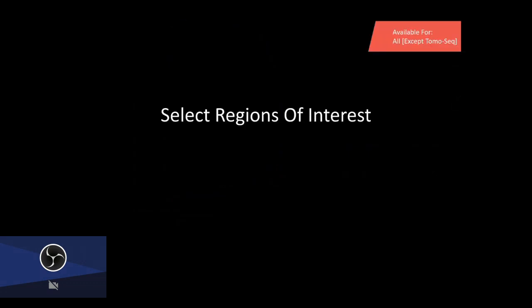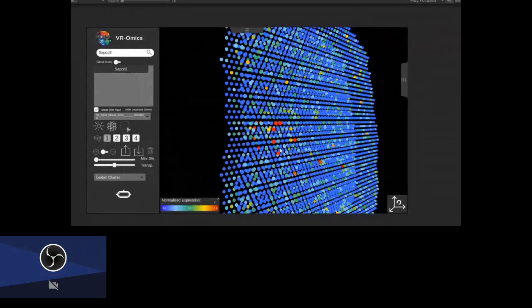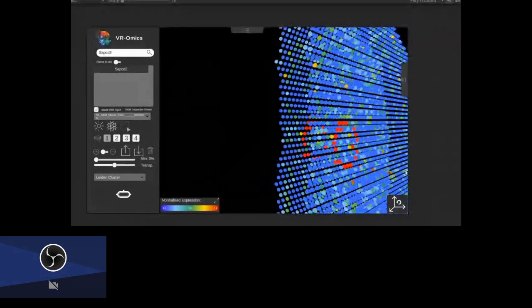Of course, you also want to select regions of interest. You just draw on the slides. You can export these regions, and they will also be transferred to the side-by-side comparison. And of course, you can do the same thing in 3D as well. We have an algorithm in place that detects underlying locations in multiple slides and creates a big three-dimensional region of interest out of it. And you can export the whole thing and create sub-regions of your data set.